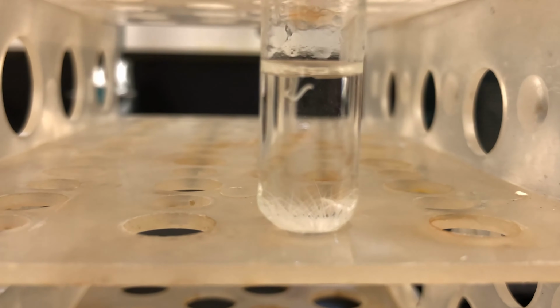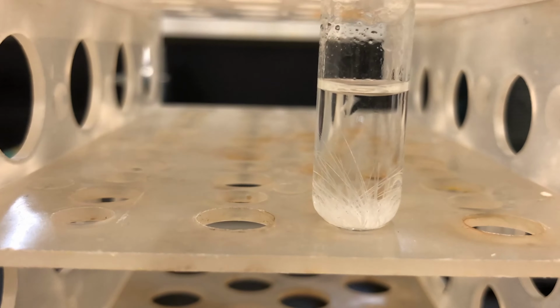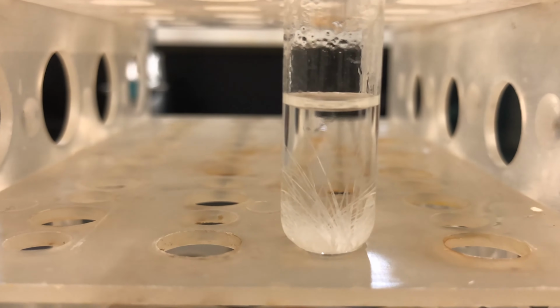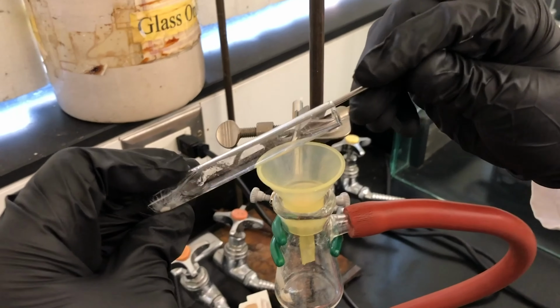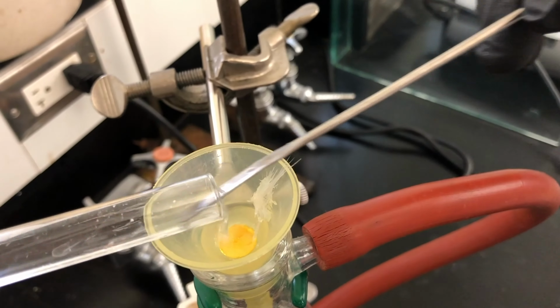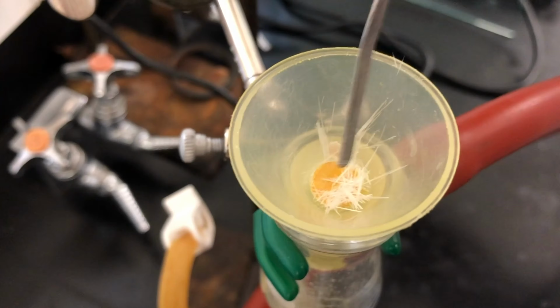If we recrystallize too fast or in the ice cold water, it traps the impurities within the crystals and it causes us to have an impure product. After we have waited 10 or 15 minutes, we can place it in ice cold water to obtain any last crystal formations. And then we can filter the crystals with the Hirsch funnel. The small test tube can be rinsed with cold ligroin to obtain as much product as possible. These crystals are ready to get weighed and characterized.